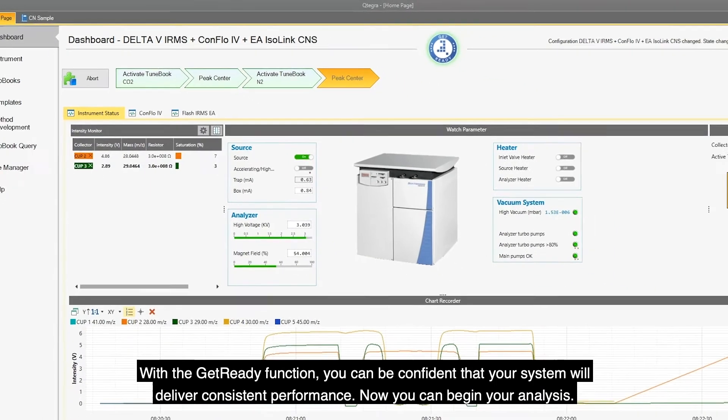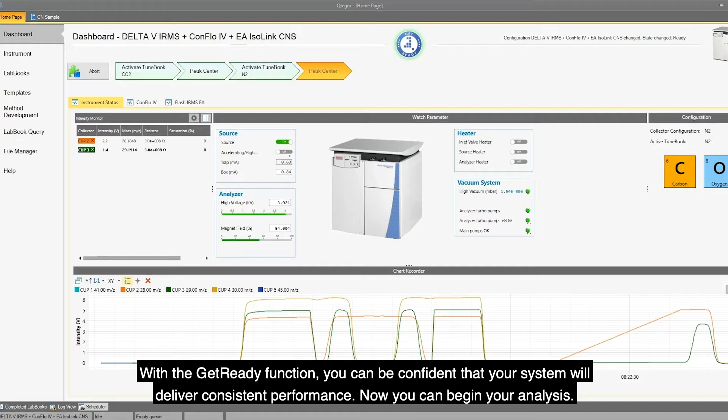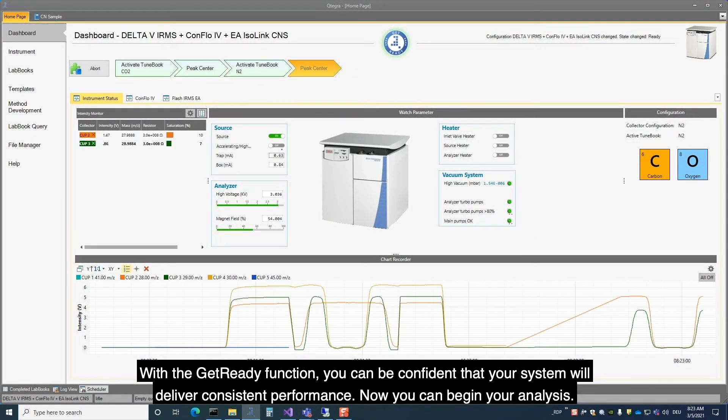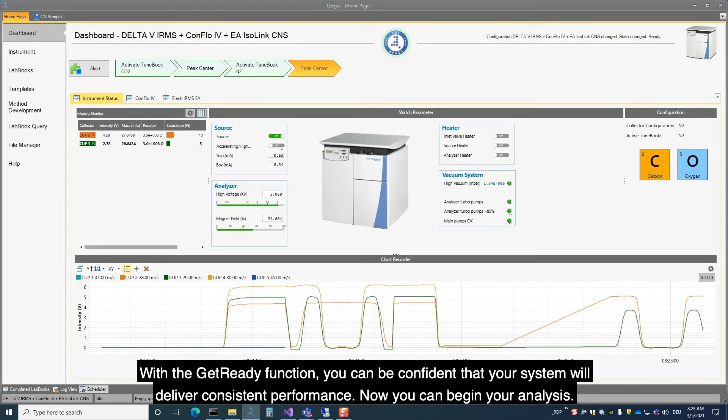With the Get Ready function, you can be confident that your system will deliver consistent performance.